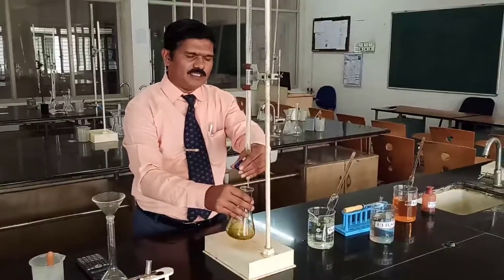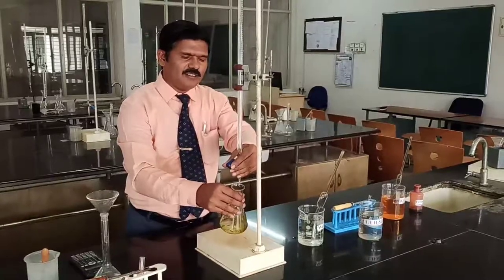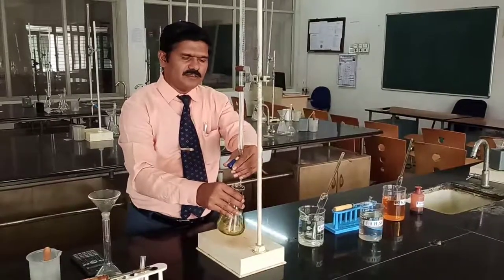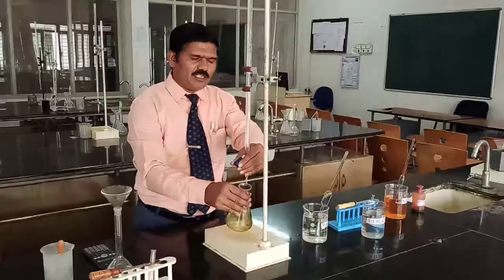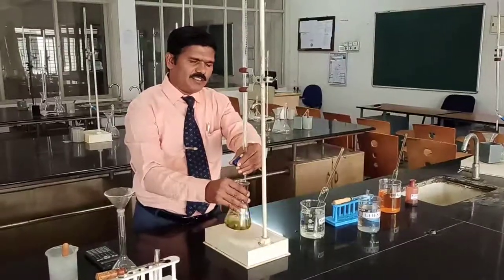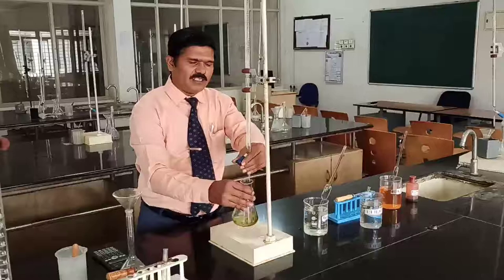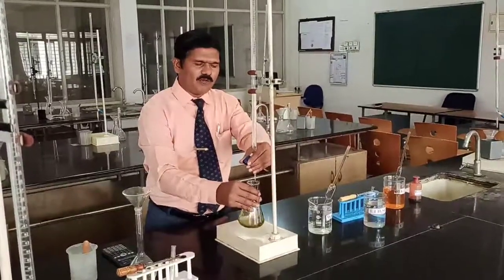Till the color of the solution changes from bluish green to reddish brown — that is the end point. During the titration, you can see the color gradually changes from bluish green and immediately changes to reddish brown. That is the end point. At that point, you have to stop adding ferrous ammonium sulfate solution.